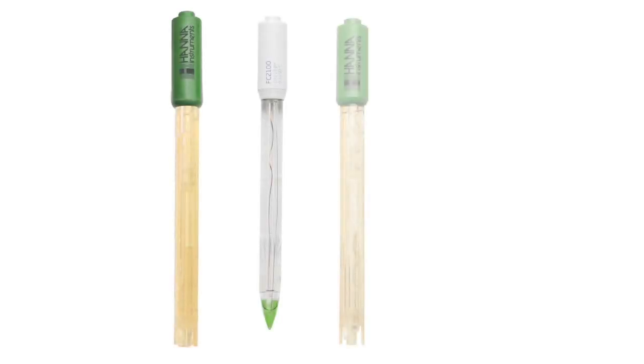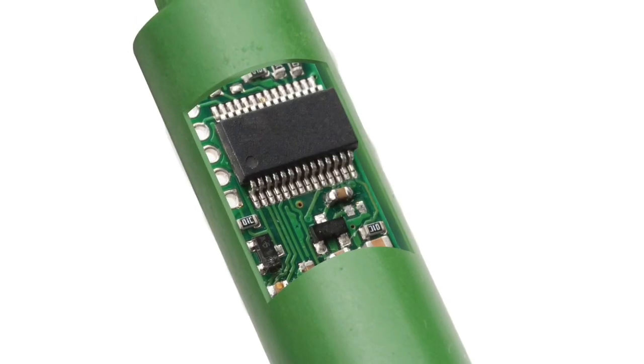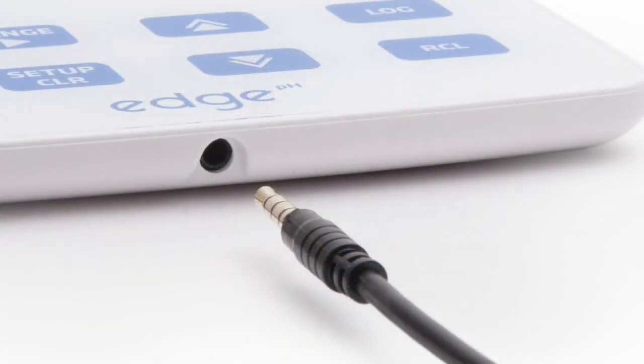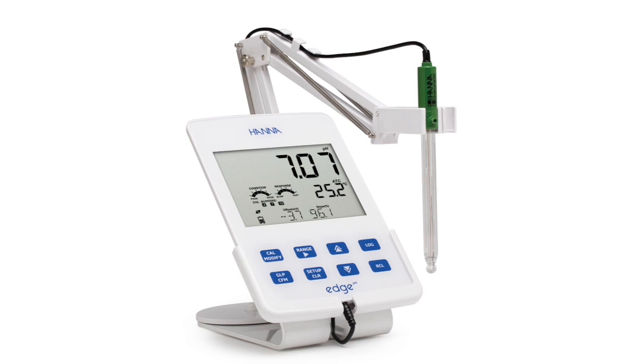Hanna Instruments offers a wide range of optional pH and ORP digital electrodes including ones designed for specific applications. Since the electrodes are digital, calibration information is stored in the electrode rather than the meter. This allows the meter to automatically identify electrodes once they are plugged in, permitting electrodes to be swapped without having to calibrate each time a new electrode is connected.